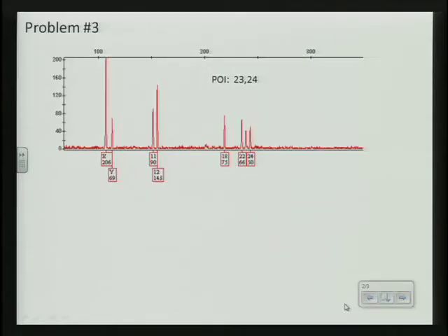Or do you apply your thresholds absolutely in situations like this? Absolutely. Okay. That's interesting. If you define a floor below which you can't be confident that it's not noise, you can't move below that floor.